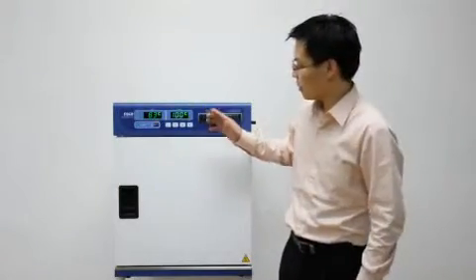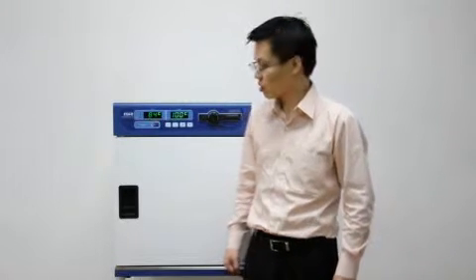Thank you for taking the time to watch this brief introduction to ESCO's force convection laboratory ovens. These ovens are available in a wide range of sizes and feature microprocessor PID based controls with program, alarm and other functions.